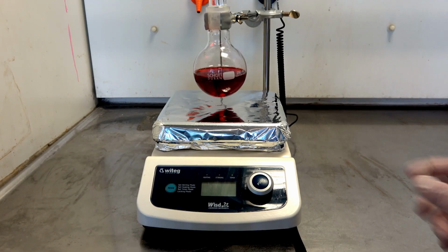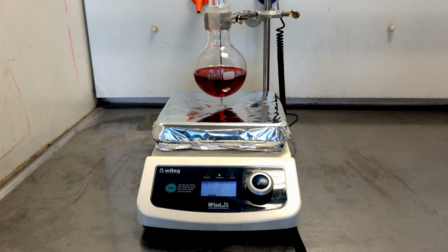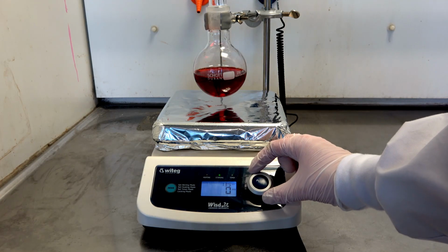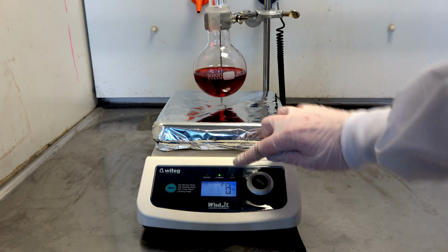Turn on the instrument, then choose the appropriate rotational speed, measured in revolutions per minute, or RPM. This controls the speed of the stirring. Increasing the RPM can reduce the time required for a solute to dissolve, and it can help to prevent viscosity issues. Some magnetic stirrers have a heating option as well.